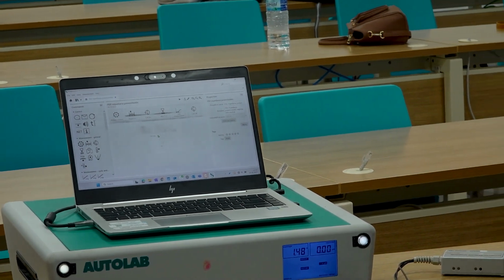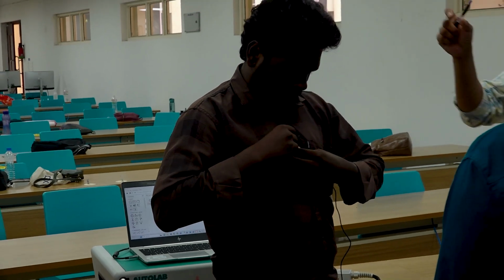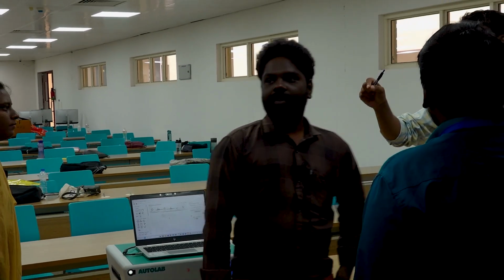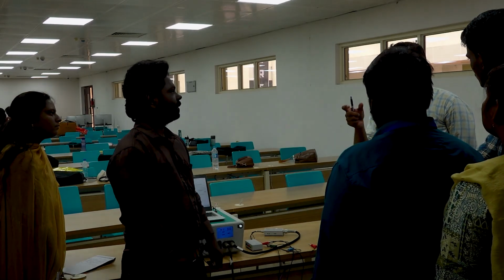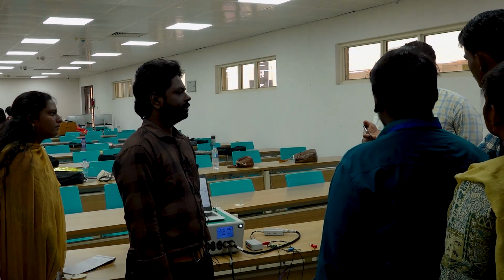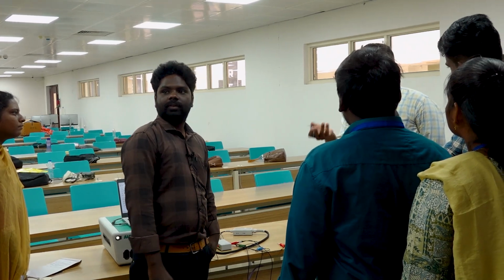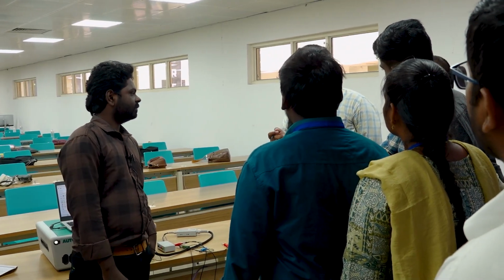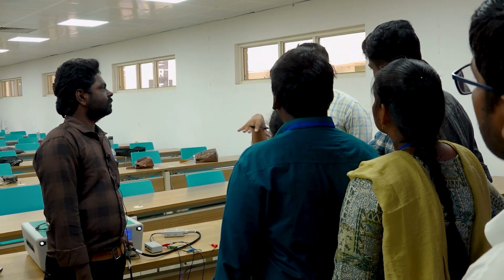Any electrochemical cell, like a solar cell or supercapacitor, whatever you are fabricating, can be converted into an electronic circuit of capacitor, resistance and impedance. When you do research on solar cells and publish a new cell or new combination of cells, journals will ask for the equivalent circuit of your cell.